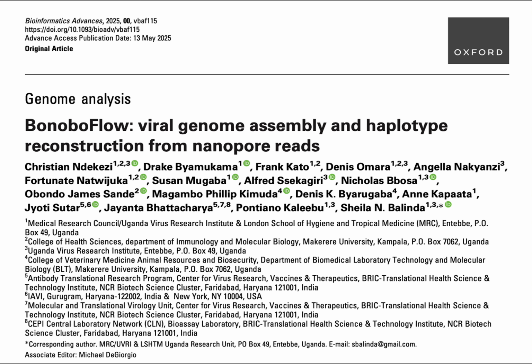We can identify those individual variants that might be driving drug resistance or influencing disease progression or how the virus is transmitted. Instead of just getting a blurry average picture. Exactly. You're moving from a generic overview to a high-resolution map of the actual viral population inside the host. This ability to capture intrahost diversity accurately is absolutely essential for better clinical management, for tracking resistance, for tailoring treatments. It leads to much more informed decisions. That really highlights the value.